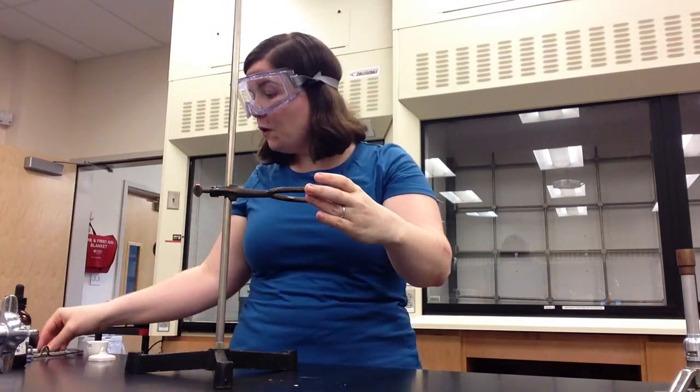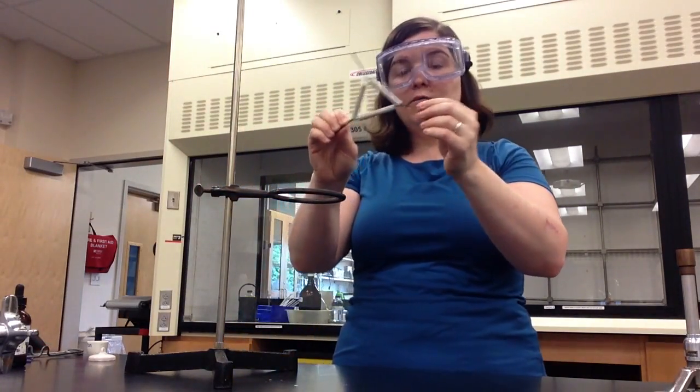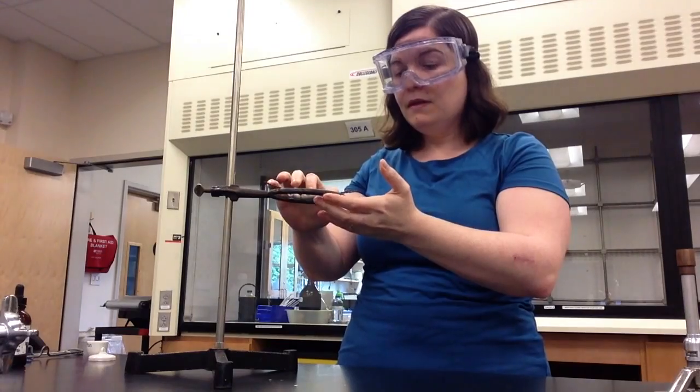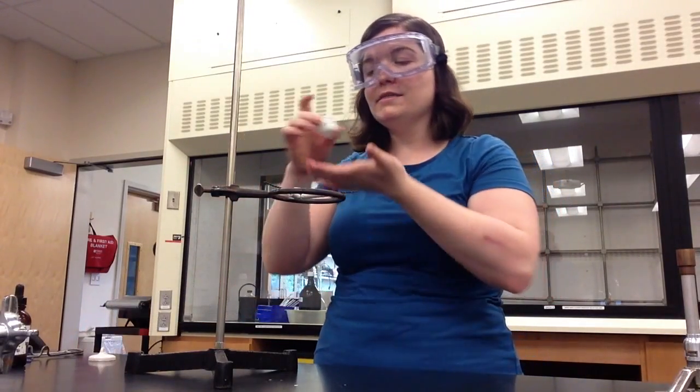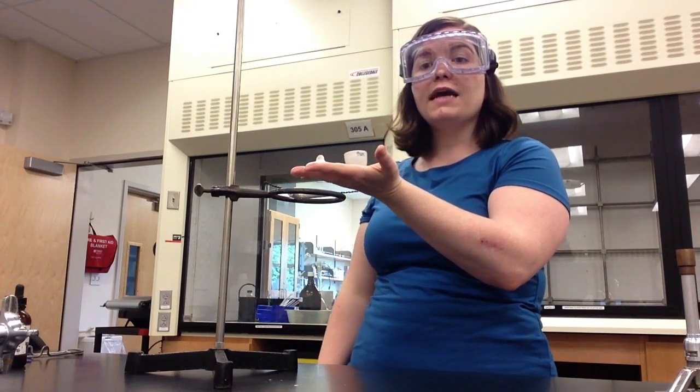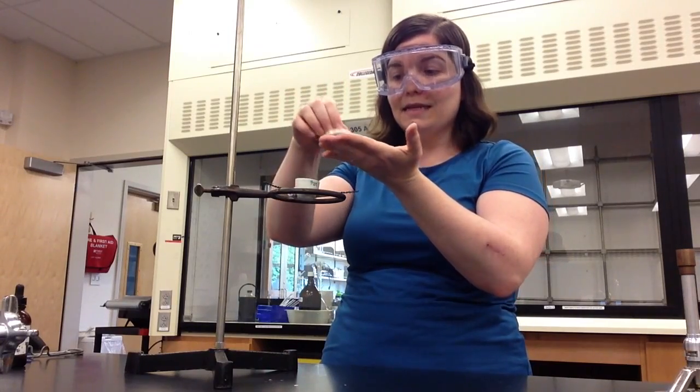And the support ring will hold the clay triangle, which can be found in your box. The clay triangle is just the right size to hold the crucible and the lid. After you add approximately 1.5 grams of potassium chlorate to the crucible, carefully place the crucible and its lid on the clay triangle.